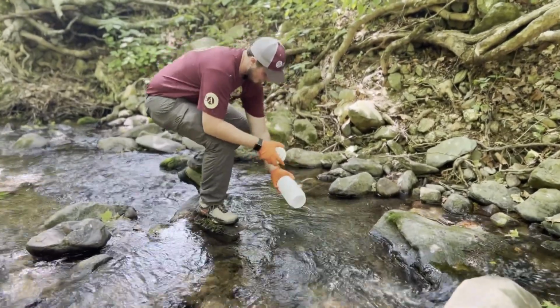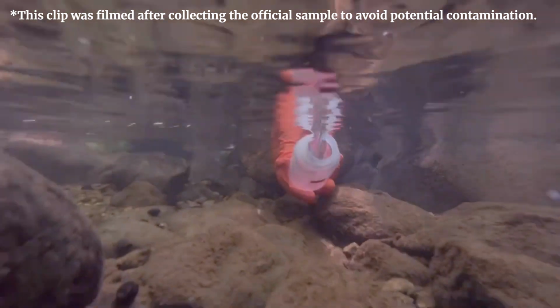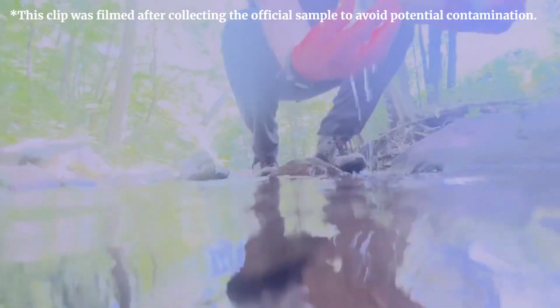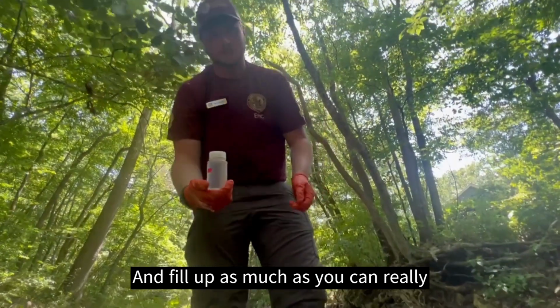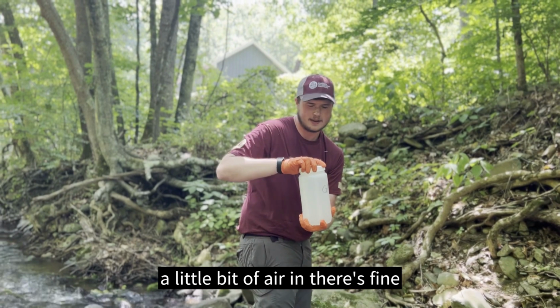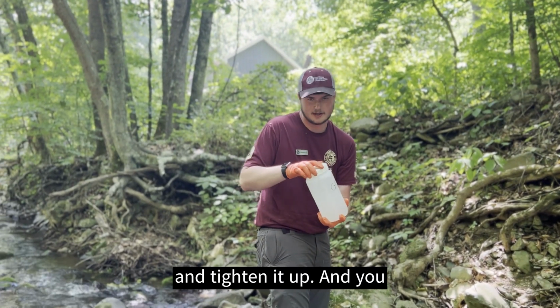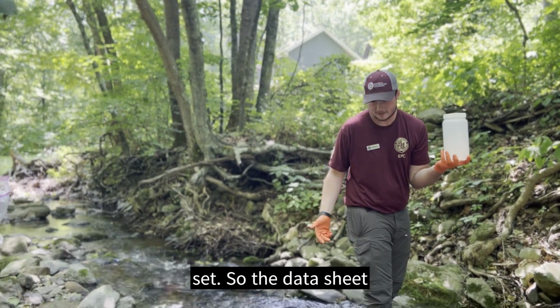And set it down. And fill up as much as you can, really. A little bit of air in there is fine. And tighten it up. And you fill out your data sheet and you're all set.